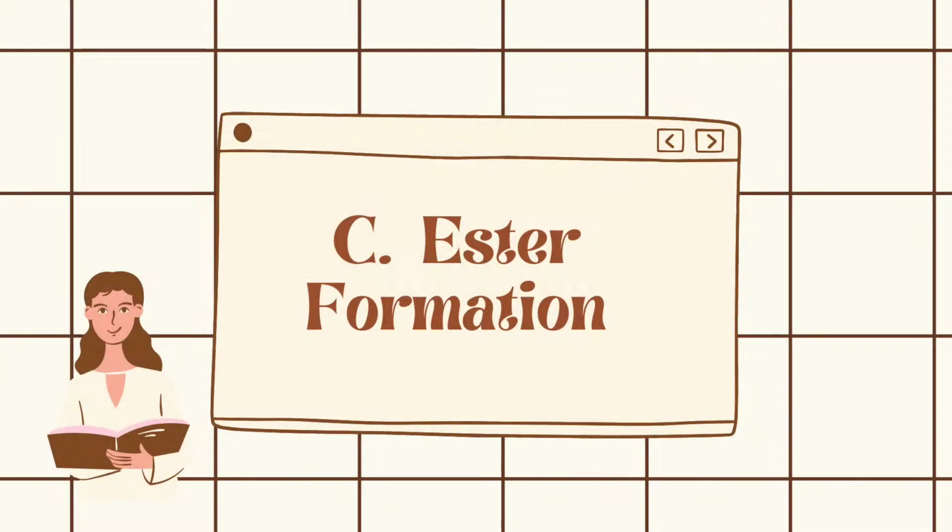Good morning, everyone. So now let's proceed to ester formation. Esters are formed when the carboxylic acid is heated with the alcohol in the presence of a catalyst. In this reaction, concentrated sulfuric acid is used as a catalyst. Dry hydrogen chloride gas is used in some cases. This method of reaction is used to convert alcohols into an ester.